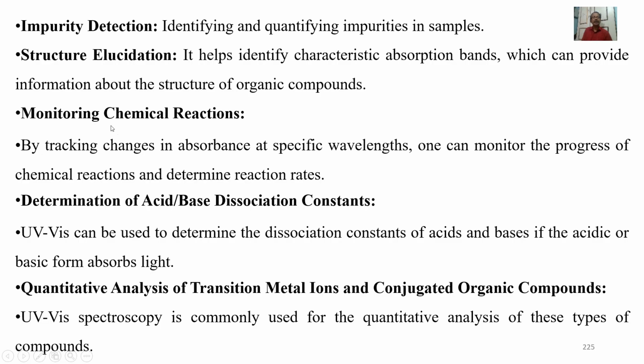Monitoring chemical reactions. By tracking changes in absorption at a specific wavelength, one can monitor the progress of chemical reactions and determine reaction rates.